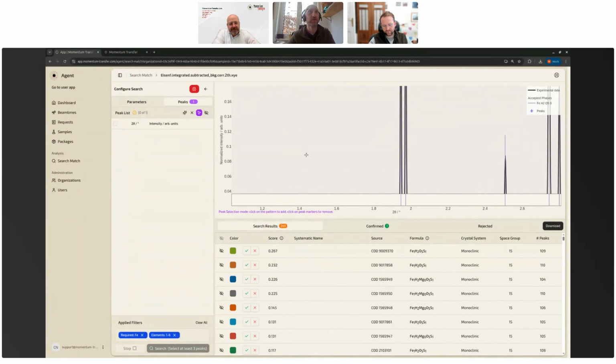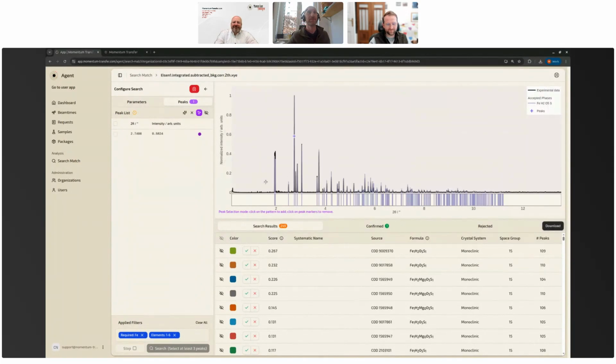My computer is lagging quite a bit. This is what I get for using Ubuntu. Sorry for that. Let's try this.